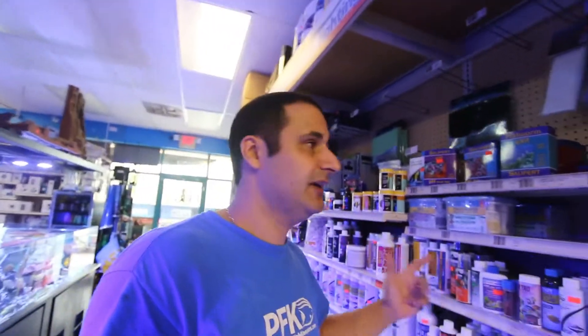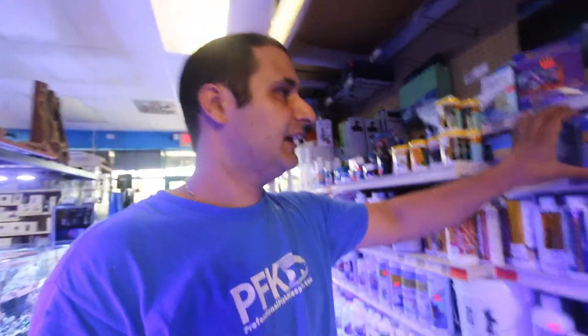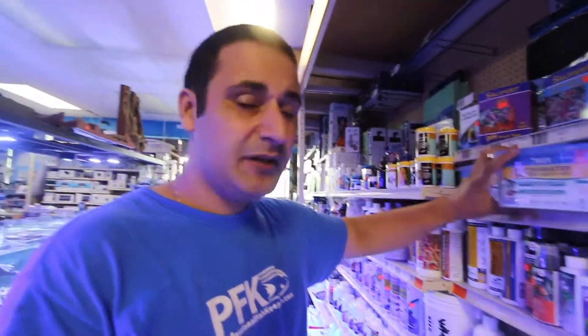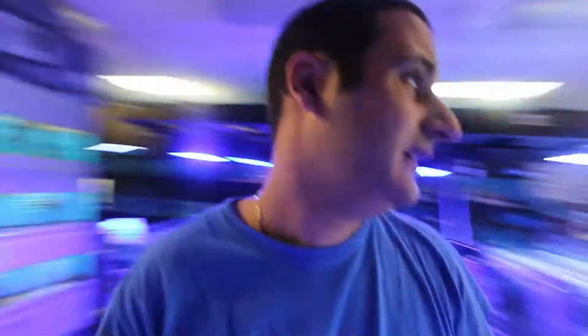You can use test strips, which are easy to read, but personally you get a lot more value for your money using something like an API test kit, which works for both saltwater and freshwater. There's a high-range and low-range version. You can also use Red Sea or Salifert test kits, but for bang for the buck, API is hard to beat.